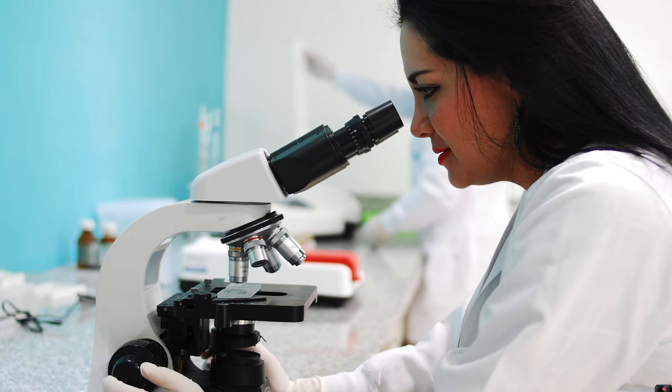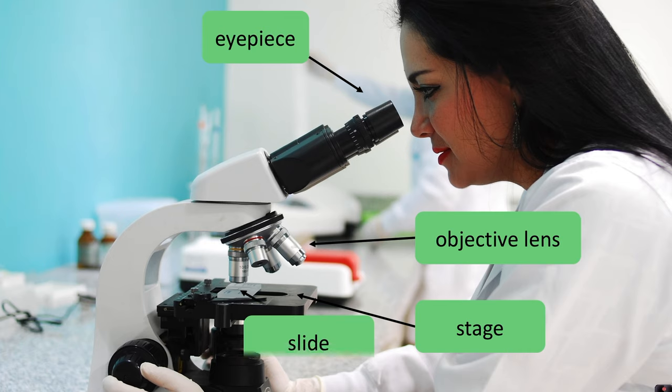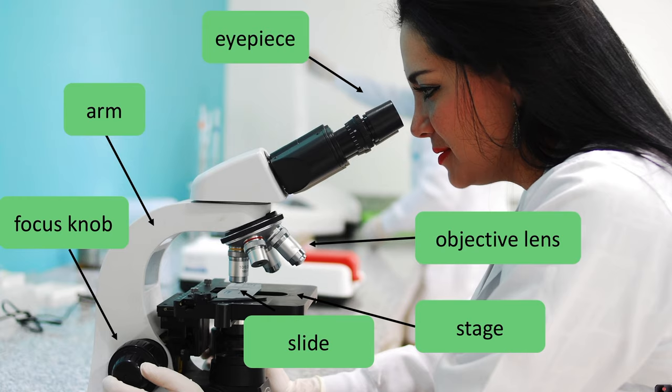The parts of the microscope that we need to be able to name are the eyepiece which is where you view the image, the objective lens, the stage upon which you put your prepared slide, the focus knob or the focus wheel and there'll often be two of those one coarse focus and one fine focus, and finally the arm with which you carry the microscope.